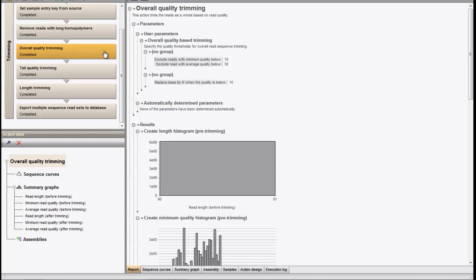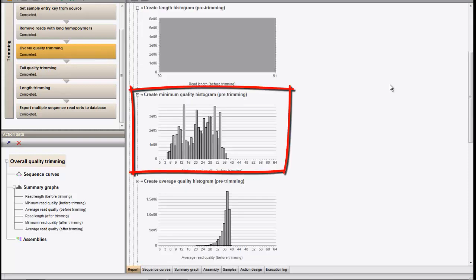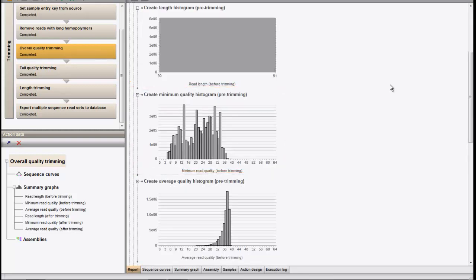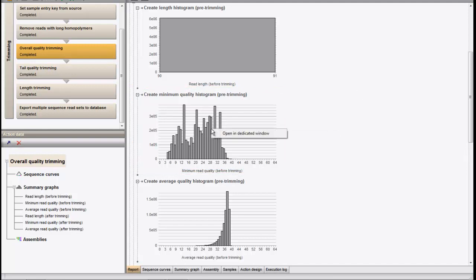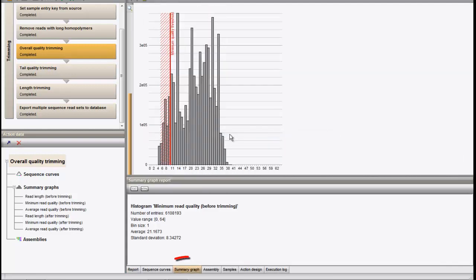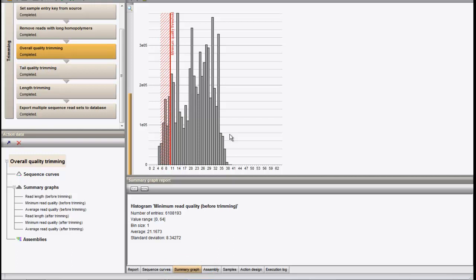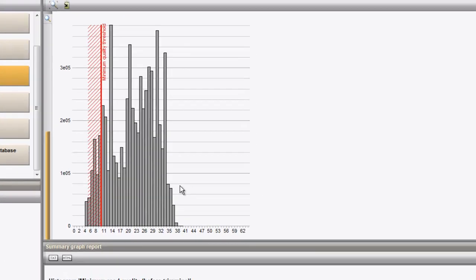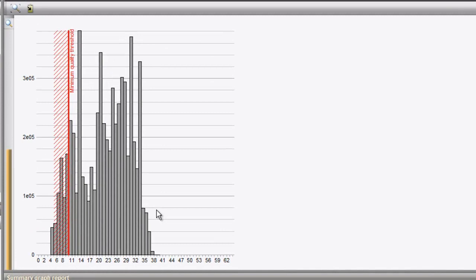Starting from these histograms, we can graphically define which parameter should be used. As an example, we can open the minimum quality histogram by right-clicking and selecting Open in dedicated window. This opens the summary graph on the read quality where the trimming threshold is indicated as a red line. We can easily change the threshold from 10 to 8 by dragging the red line.